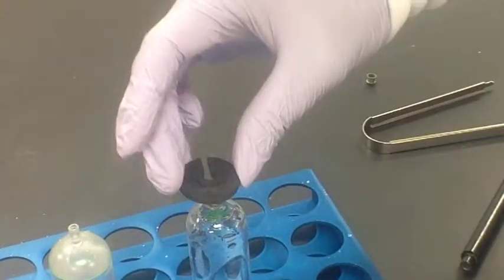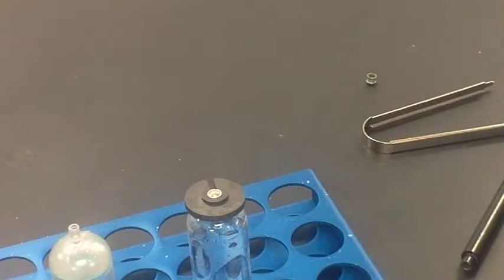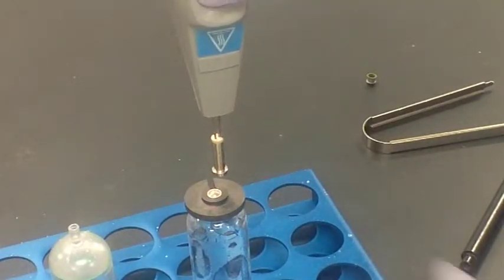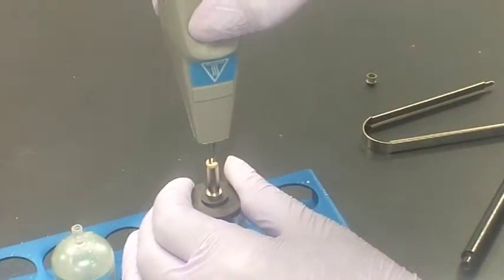Using the seal guide prevents the seal former from being pressed into the tube shoulder. If not using the seal guide, beware not to press the seal former onto the tube shoulder. It may cause the tube to leak.